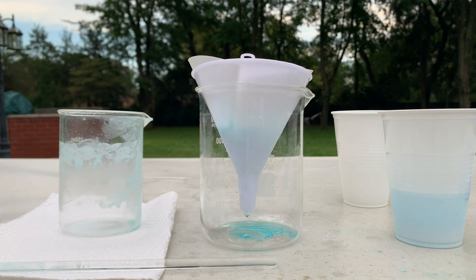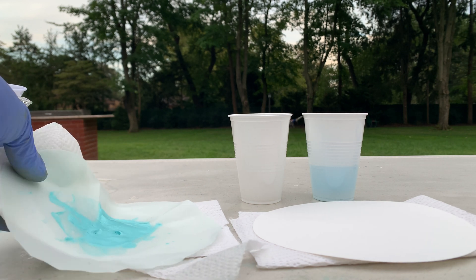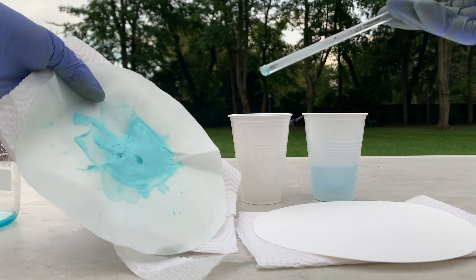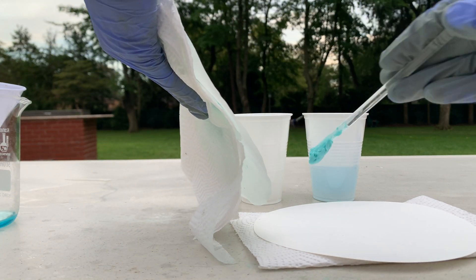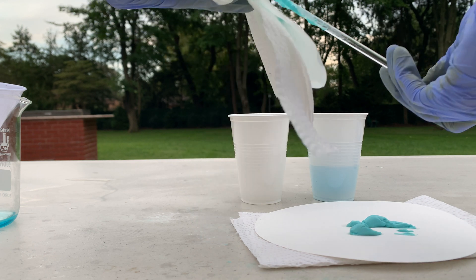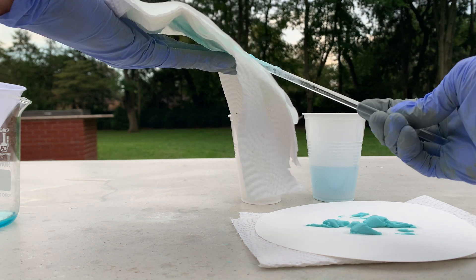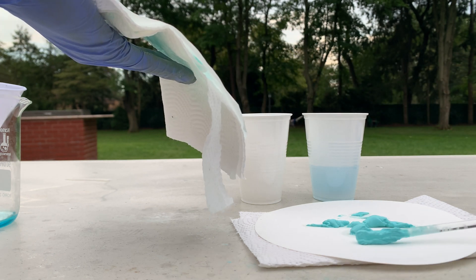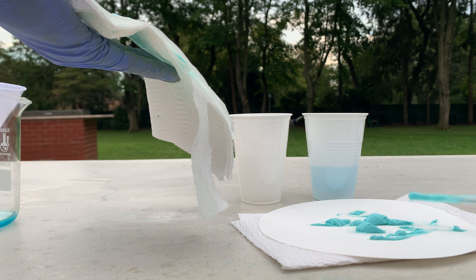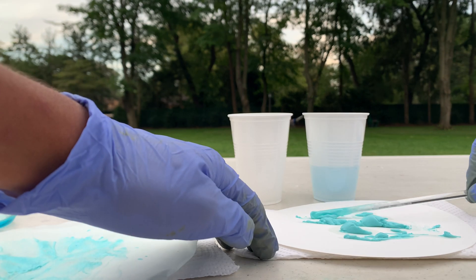I'm going to let this filter out and we'll see how our copper carbonate looks after drying for a bit. I finished filtering the solution and I'm going to be transferring it to a different filter paper now to help speed up the drying process. It's still very wet but it has the beautiful copper carbonate light blue teal-like color to it, and I can't wait until it completely dries.